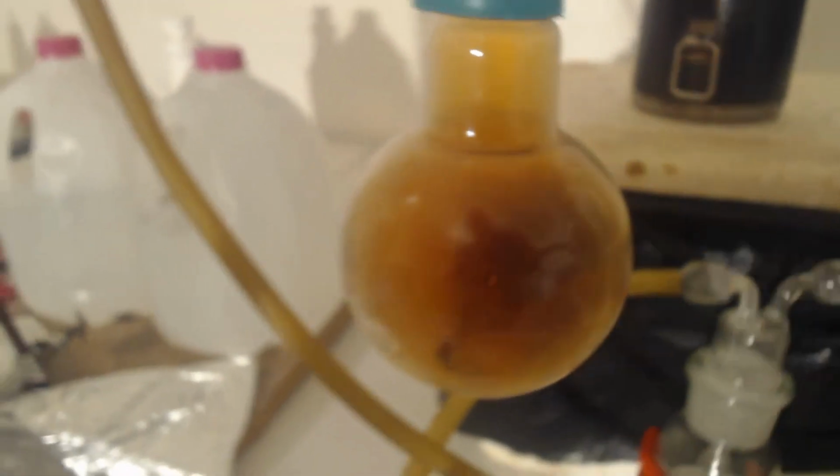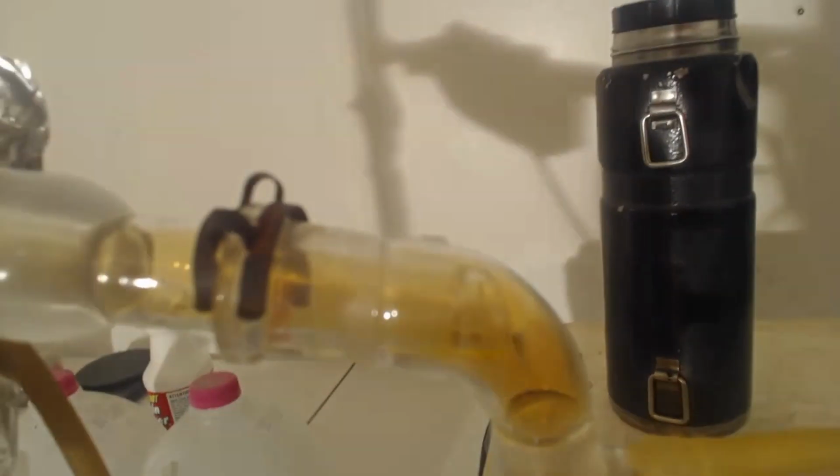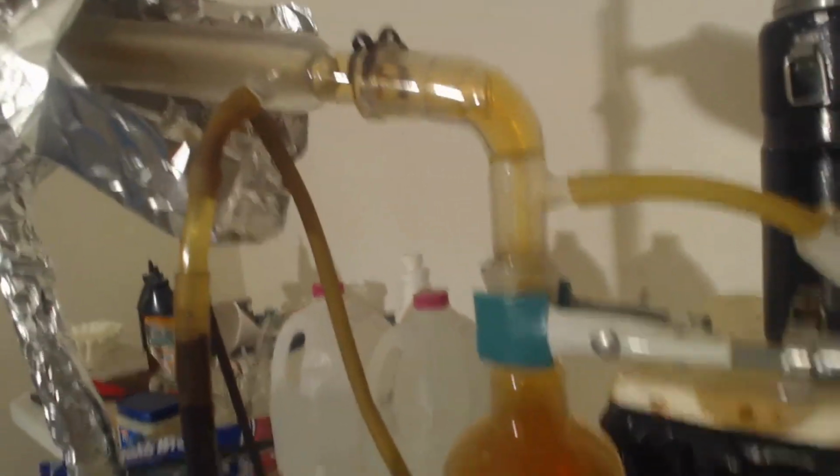Hopefully after it starts distilling a little bit, some of this gas will go away. You can see in the condenser it's not that bad anymore. The still head's still bad. The bubbler's going back there, it's still good. This is the suck back trap for the bubbler, and you can see there's no gas in it yet. The still head's actually about 80 degrees right now. And it's going to slowly go up to 83. It's coming over right now, though.